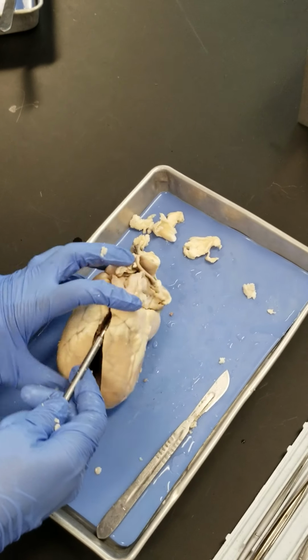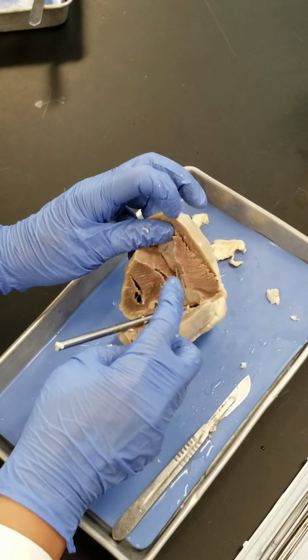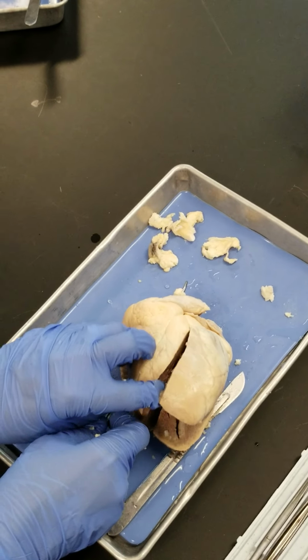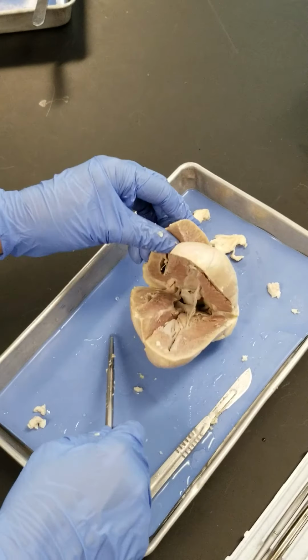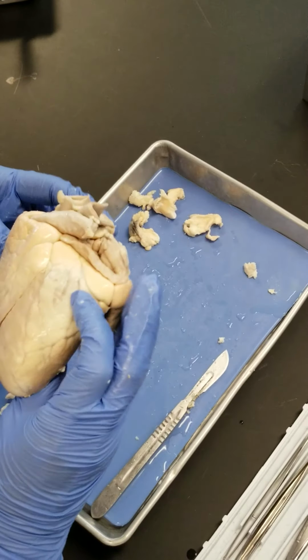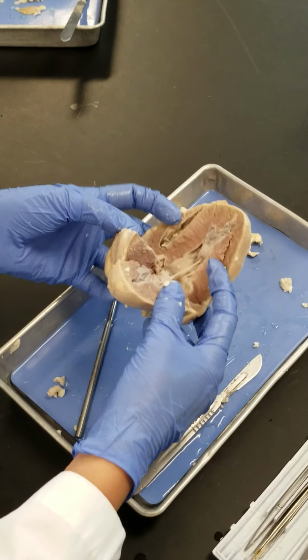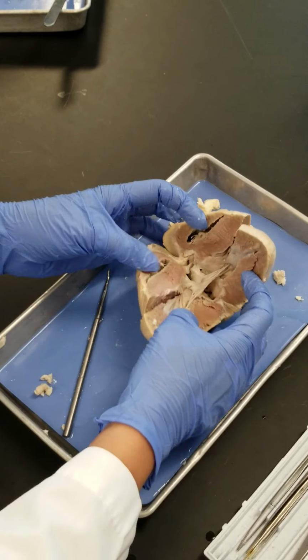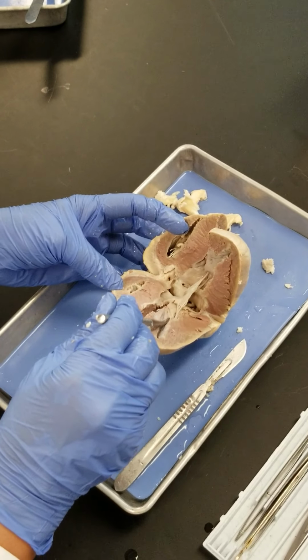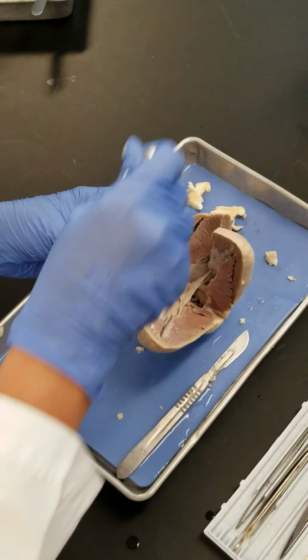If I pass a probe through the bicuspid valve and get to the chamber above that, what do you call that chamber? Left atrium. If you pass through the tricuspid valve and get to the chamber, what do you call that chamber? Right atrium, right? So you see that everything is clear now. You don't need to go search around the outside for anterior, right side, left side. Everything is in front of you. You already know the chambers, right ventricle, left ventricle. You know the valves. You know that if you pass through the valve, you get to the atrium.